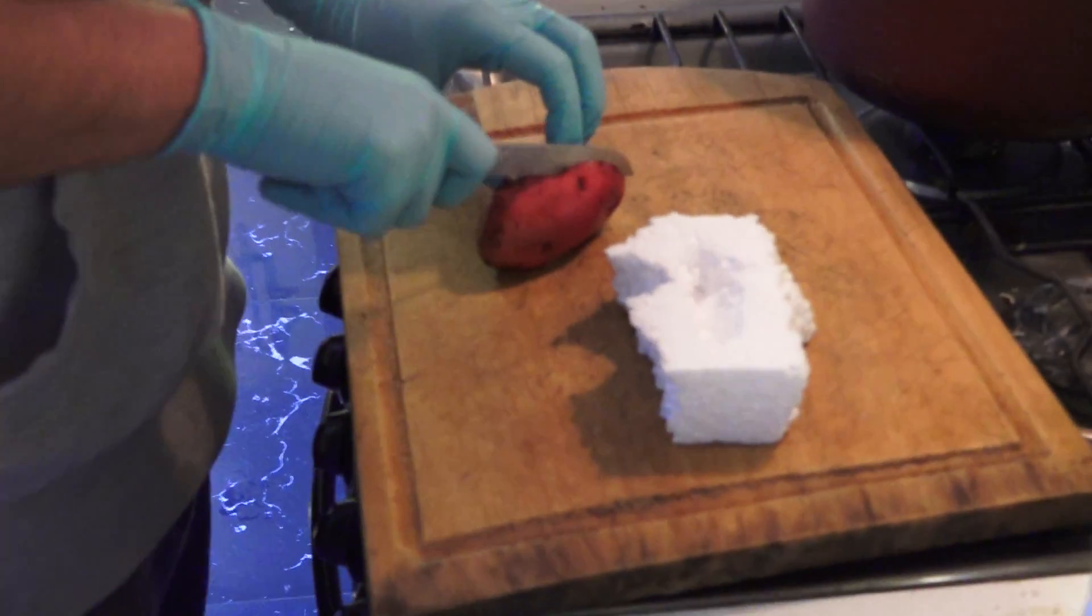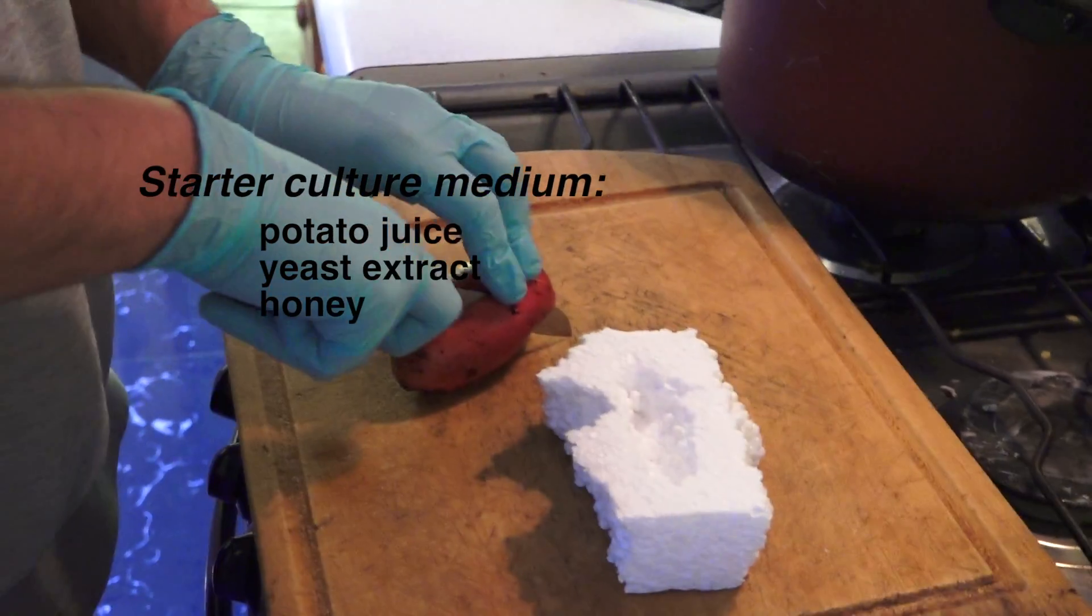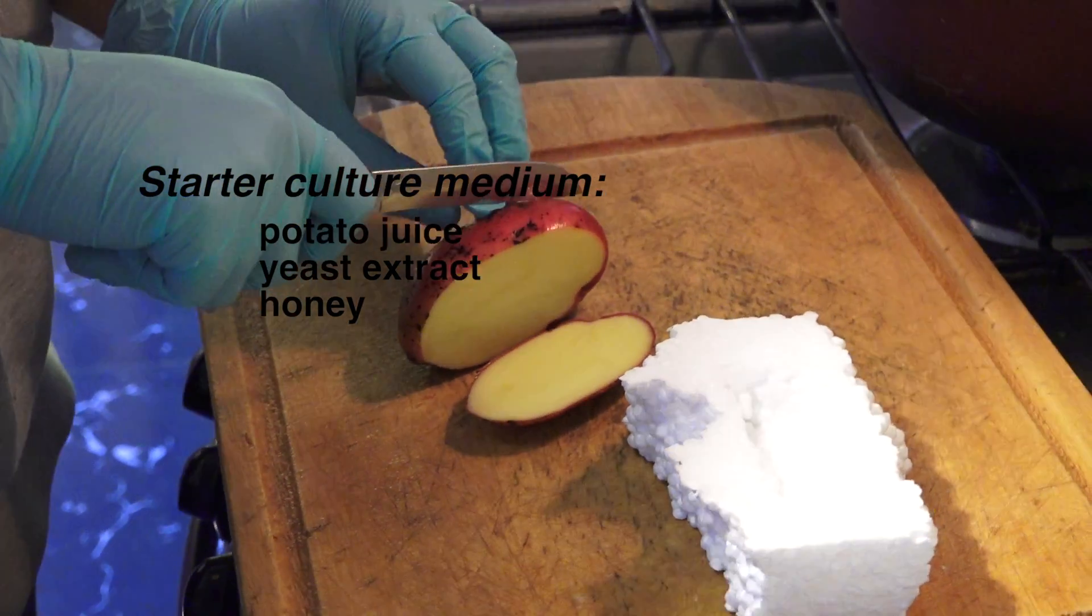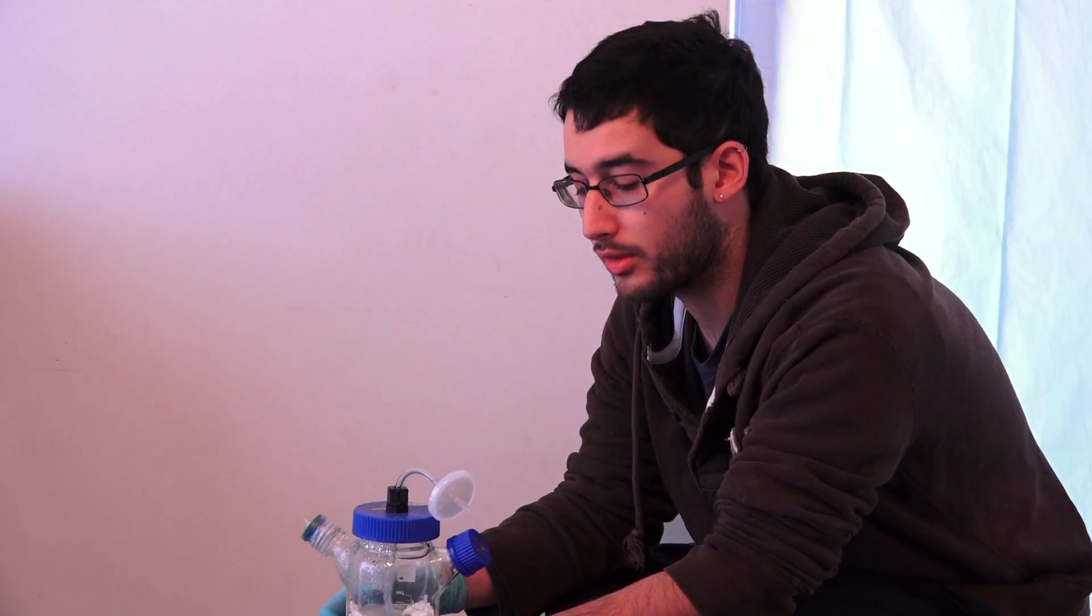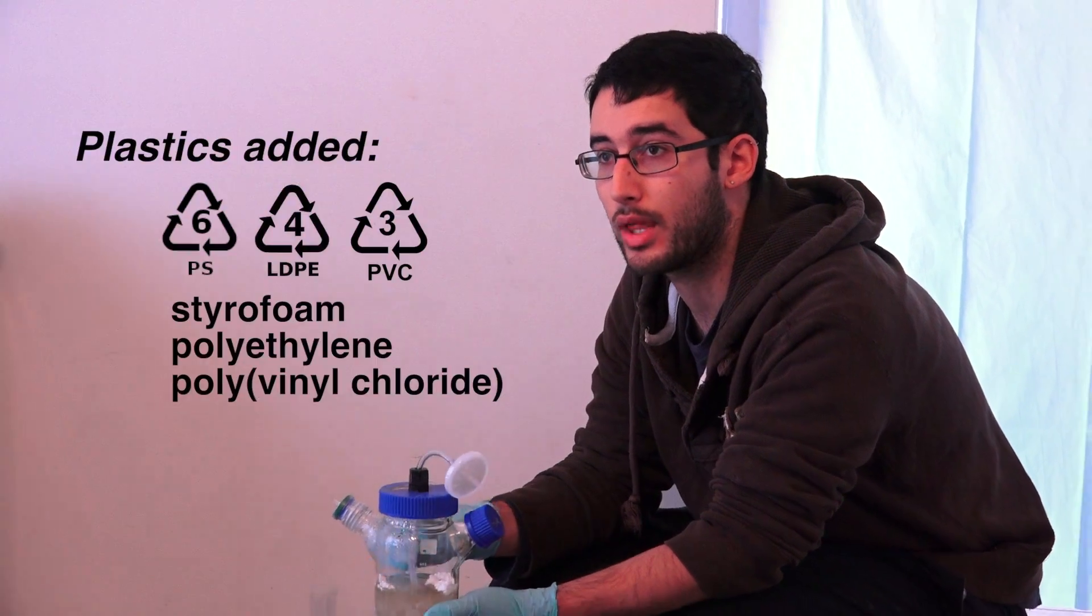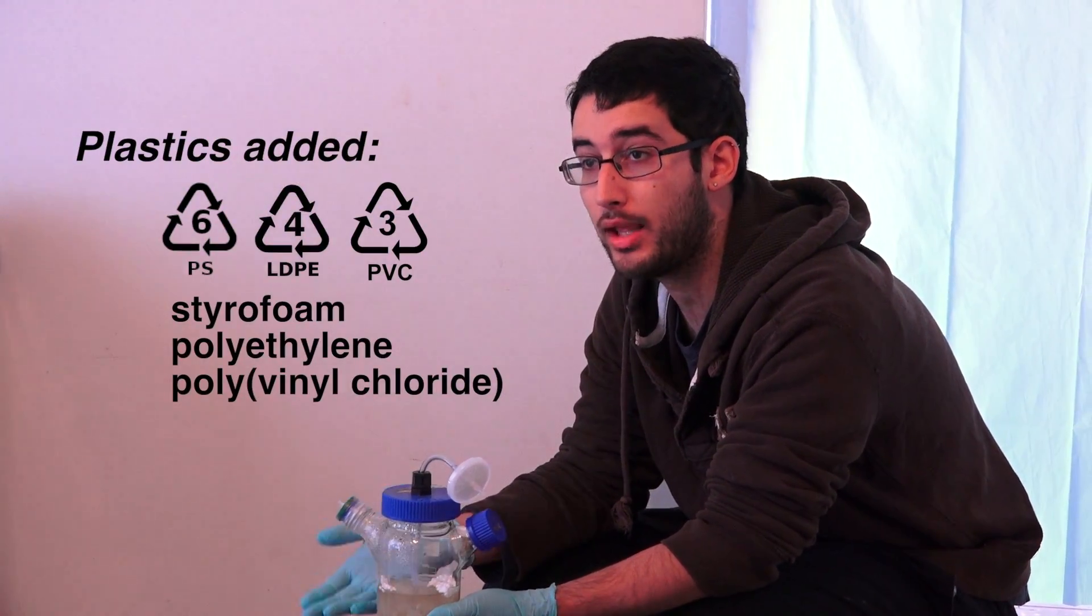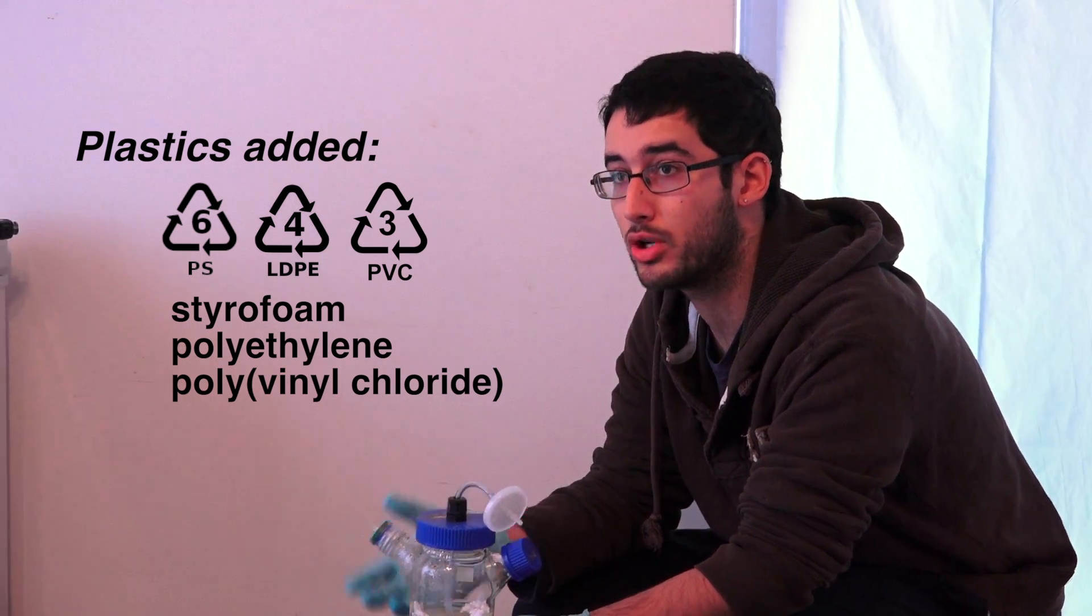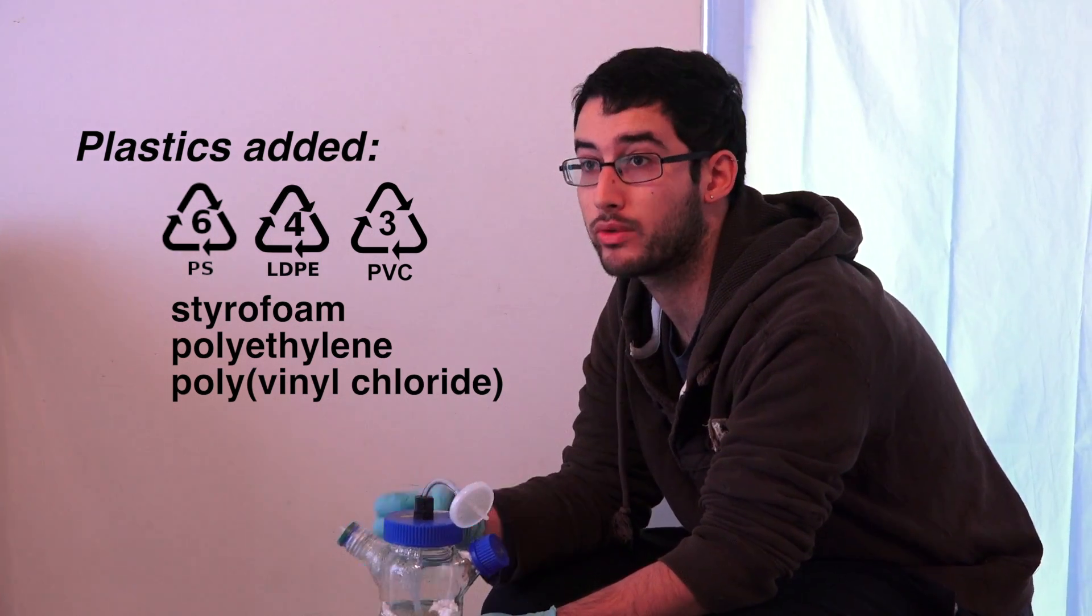I started this with some regular broth. It's basically potato juice and honey. And as the fungi eat up the broth, I add in the plastics so that when they run out of the potatoes to eat, all that's left in there is the plastics. So they're forced to adjust their metabolism so that they're eating mostly plastics.